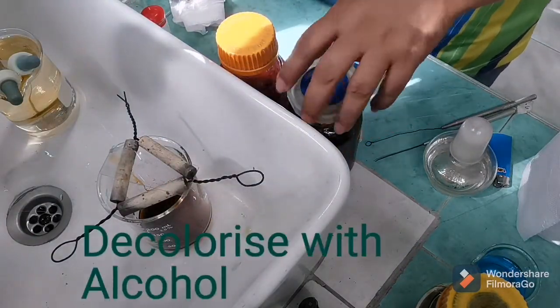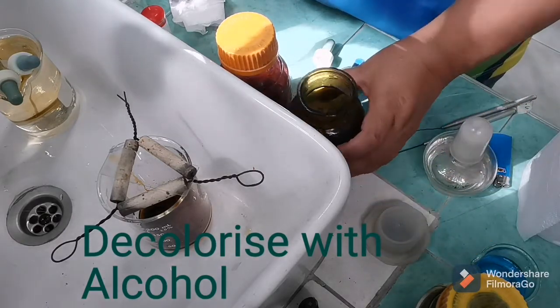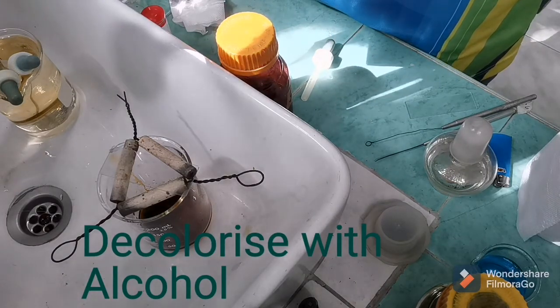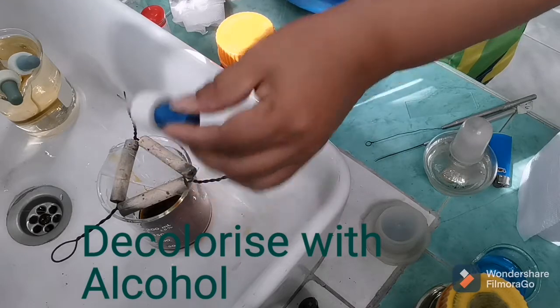And then next, we are going to decolorize it for 15 to 30 seconds using the alcohol. You could count.